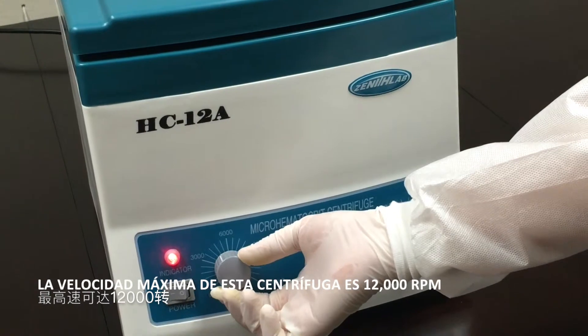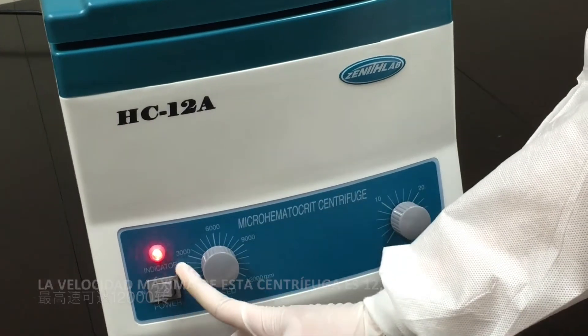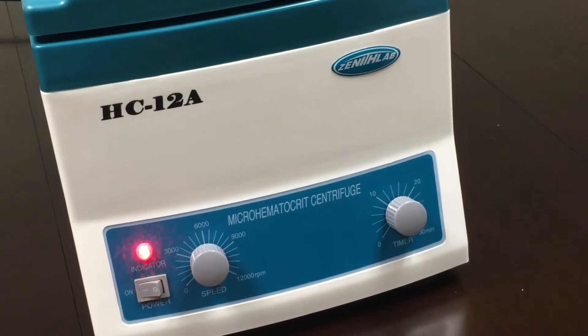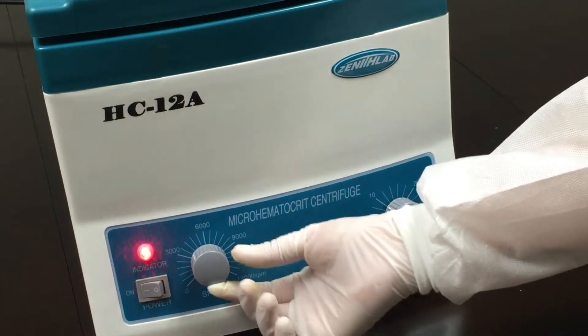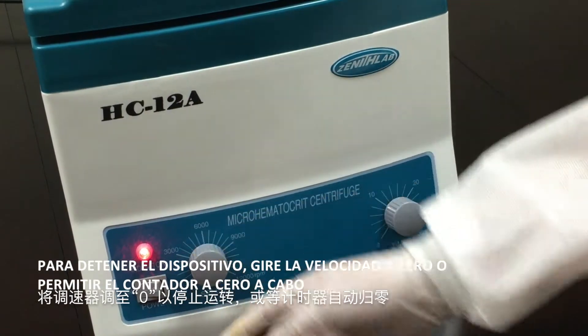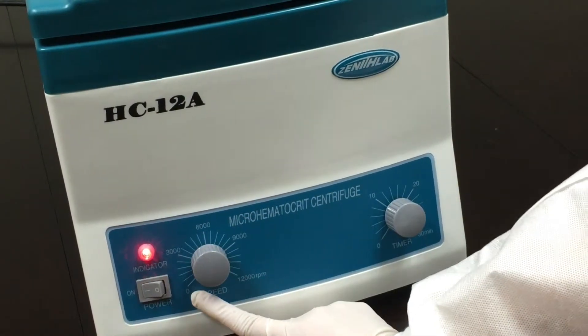The maximum speed for this device is 12,000 RPM. To stop the device, turn the speed to zero or allow the timer to zero out.